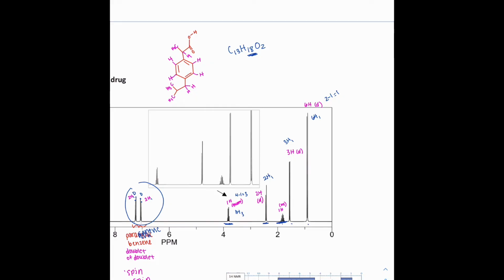Just wanted to clarify that in case you're confused about why that shows up where it does in comparison to this quartet. So I would immediately jump and ask, okay, where is the most electronegative area on this compound, leaving out that benzene? So we can jump up here, and I drew these implicit hydrogens to make it a little easier. Okay, so here we do have 3 hydrogens from that methyl, and then we have another hydrogen, and I think this is a match, because there is this one hydrogen right here, and then it has 3 neighbors. So that's honestly perfect.